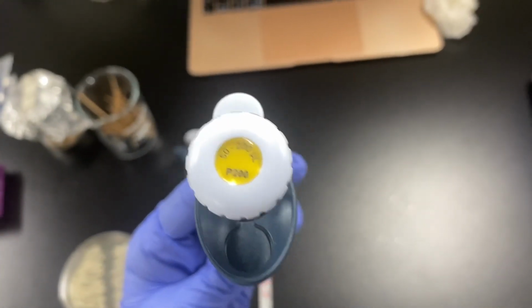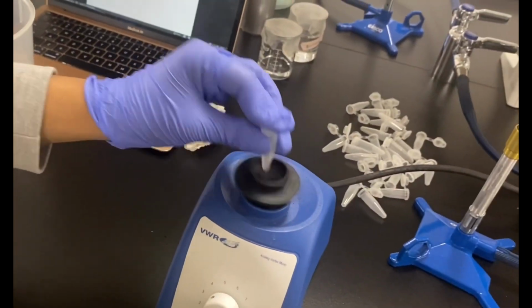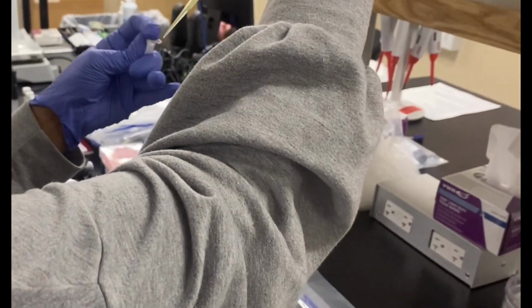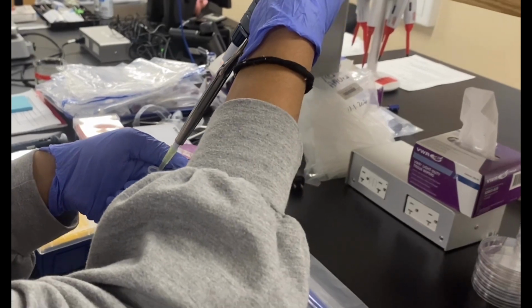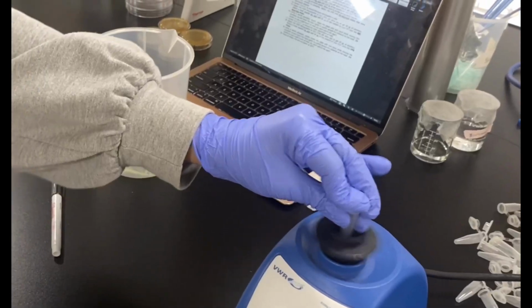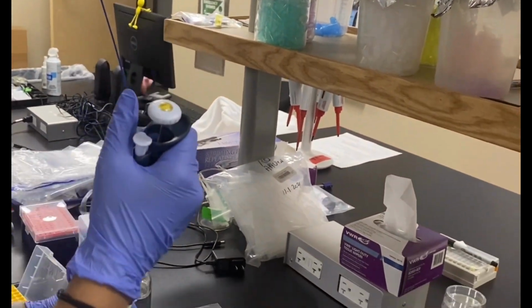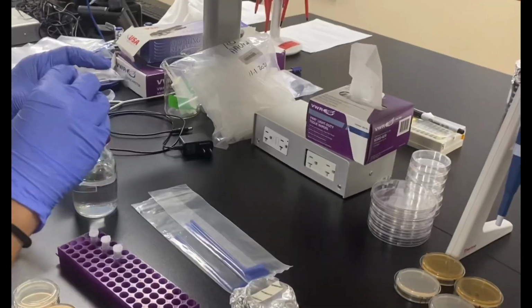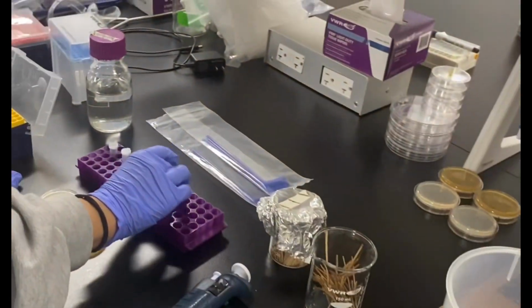Adjust the P200 micropipette to 100. This will allow you to get 100 microliters of solution. Attach a fresh pipette tip and add 100 microliters of the content in tube 2 and transfer it into tube 3, containing 900 microliters of sterile water. Make sure you vortex during each transfer. Once again, using your P20 micropipette, add 10 microliters of the solution in tube 3 into tube 4, containing 990 microliters of sterile water. Make sure you once again vortex during each transfer.